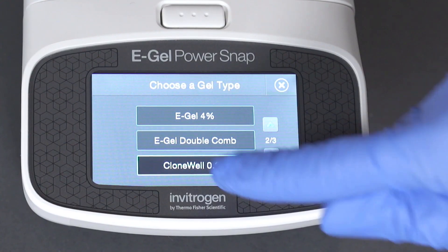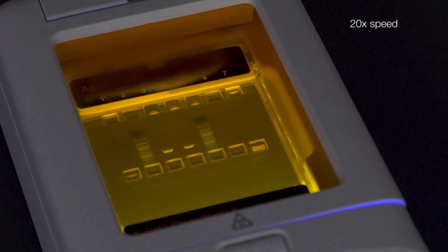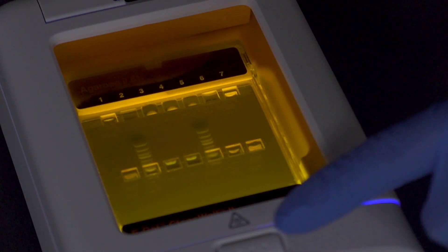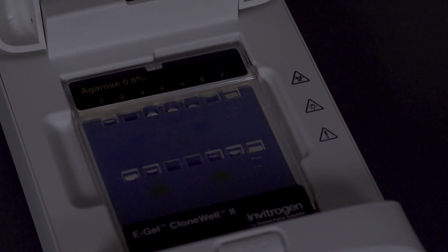Run the eGel CloneWell protocol. Observe as the bands of interest migrate and approach the recovery well. Pause the gel when the band of interest reaches the reference line indicated on the second row of recovery wells.